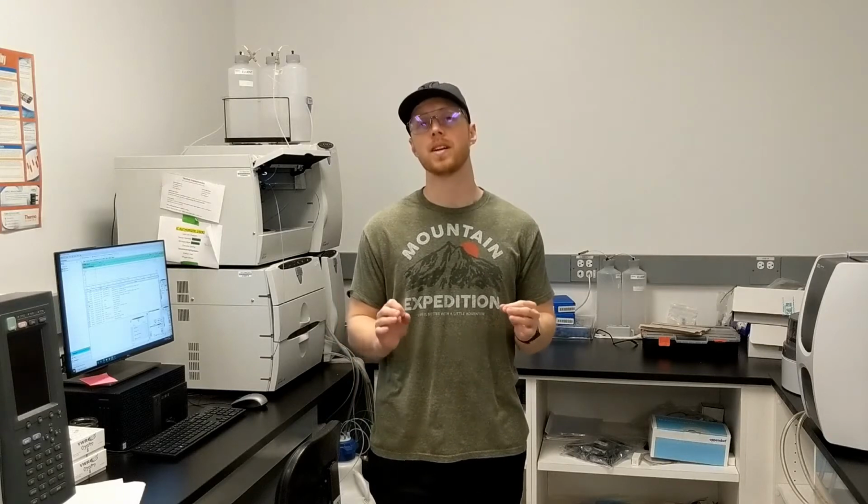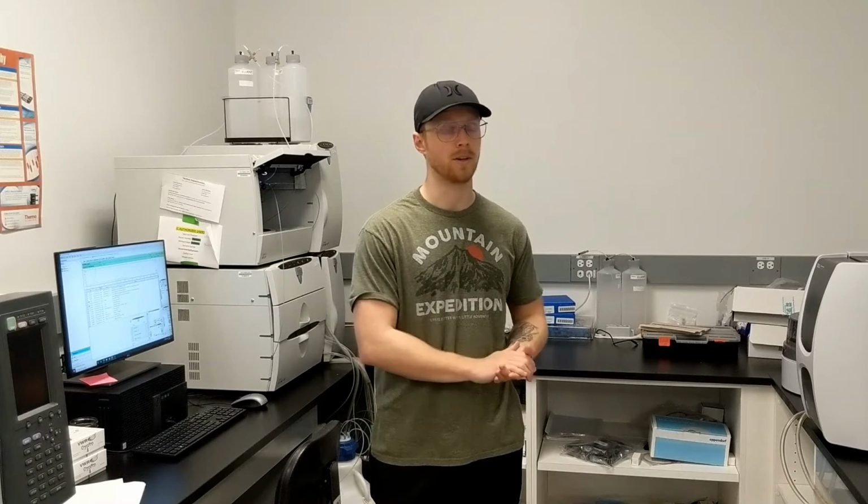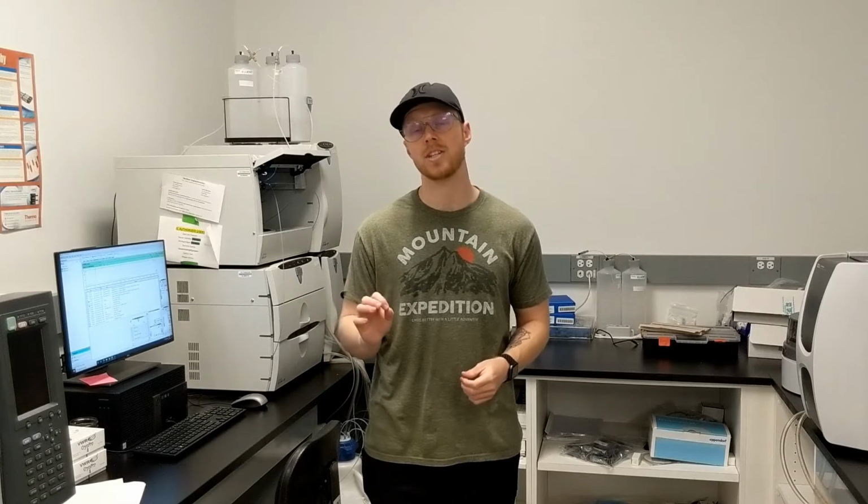If you want to start an IC run, the first thing you need to do is make sure that your samples are prepared in the correct way. We talked about this in the last video, so if you haven't seen that, go back and check it out. Make sure you know what you're doing. To summarize it, you need to make sure that the highest ion concentration in your sample is below 100 parts per million, or milligrams per liter. And you need to make sure that your sample is filtered.